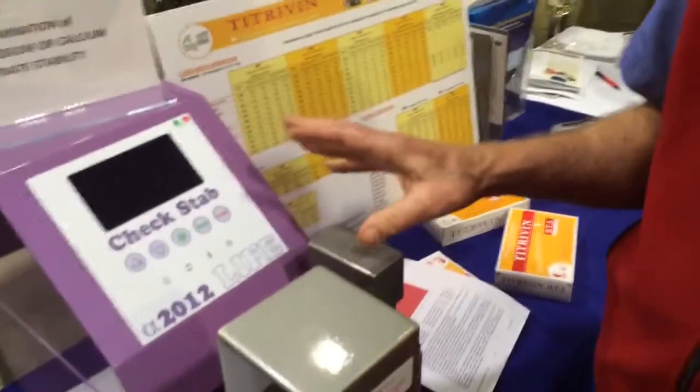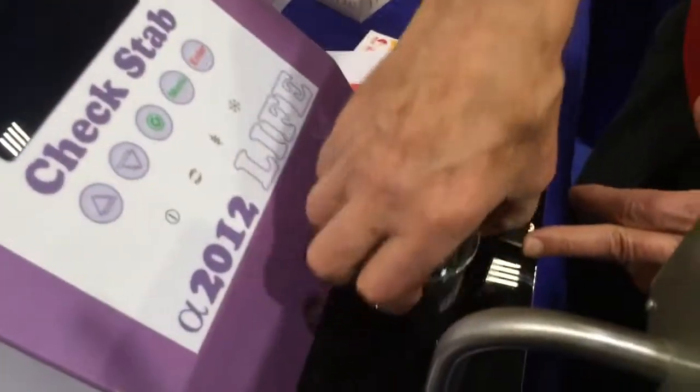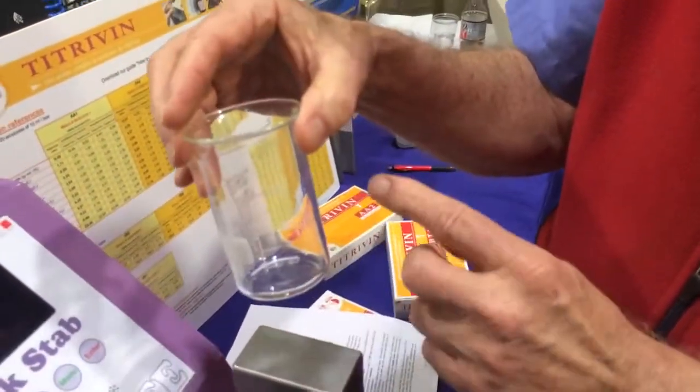This is an instrument for doing cold stability, and what we're doing is we're using a beaker with 100 ml of sample.